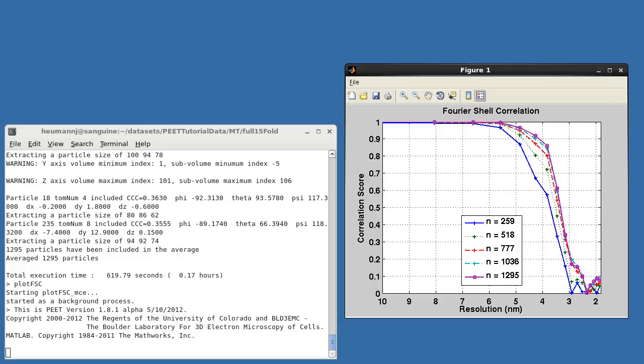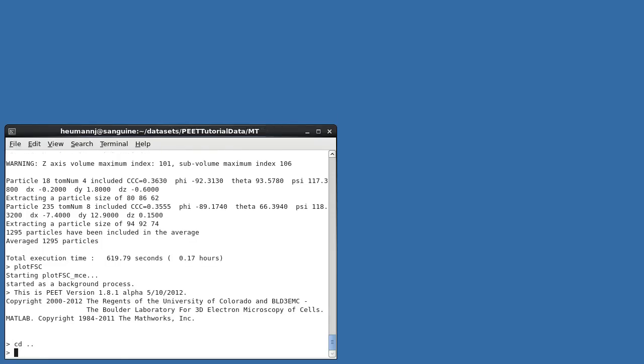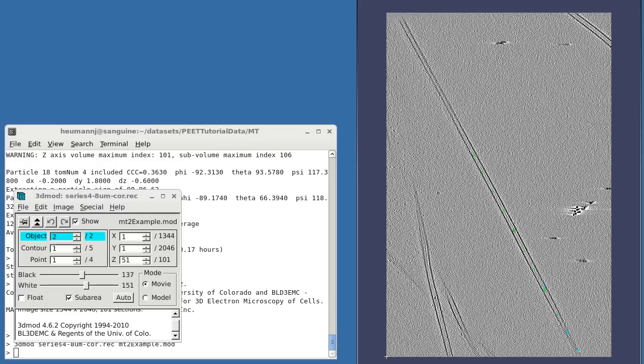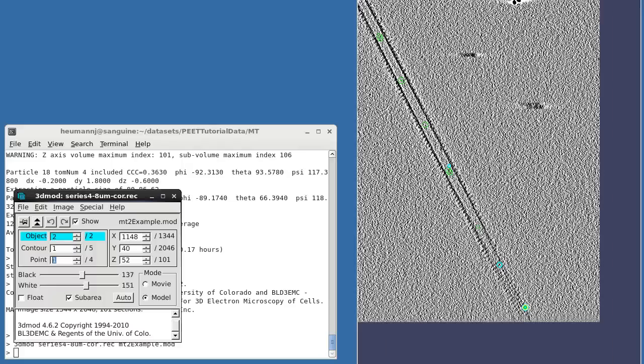I've created a sample model to show you how this works. This model contains two objects. Object 1 points, shown in green, are placed as before at the center of the microtubule. Object 2 points, in cyan, are placed on the surface along protofilaments. Contours and points in Objects 1 and 2 are in exact one-to-one correspondence, with each contour representing the length over which we can trace a specific protofilament.